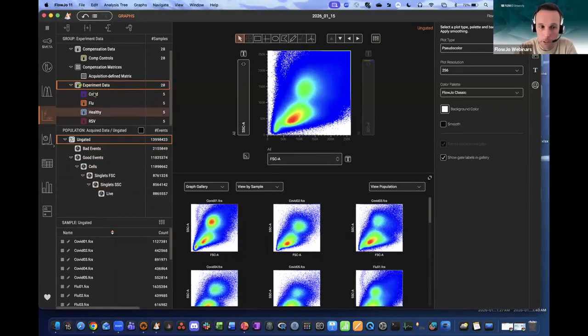And because I ran the QC, there you see the check mark is there on my experimental data, and I had my good event, bad event, as I mentioned. Okay. With that, that's the end of this presentation. I'm happy to take any question that you may have regarding QC in FlowJo. So put it in the chat or put it in the Q&A so I can answer.